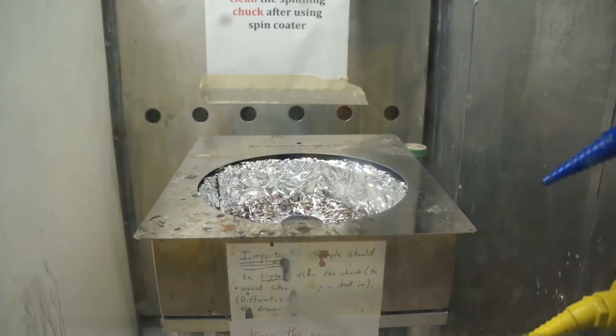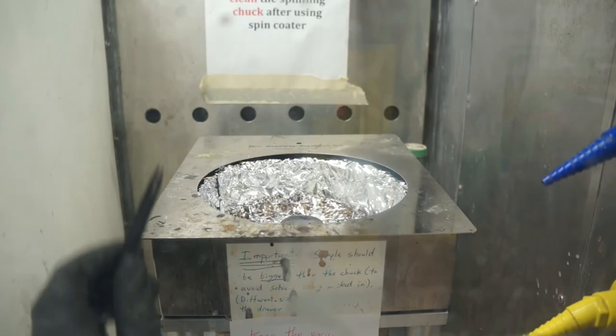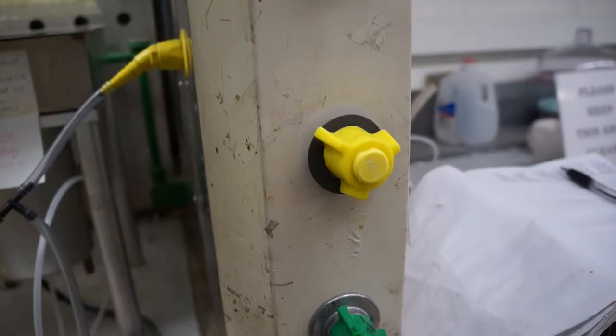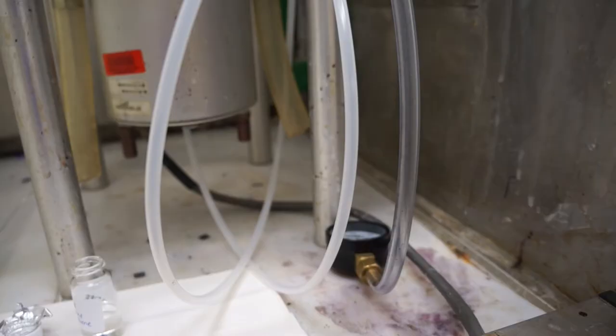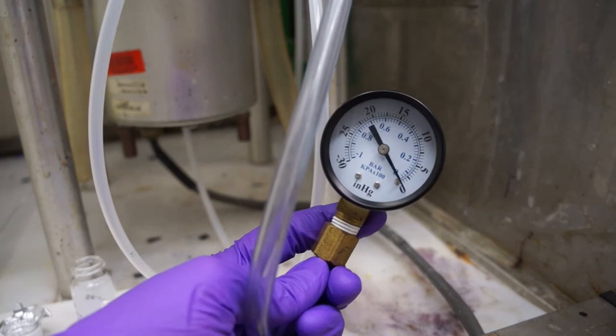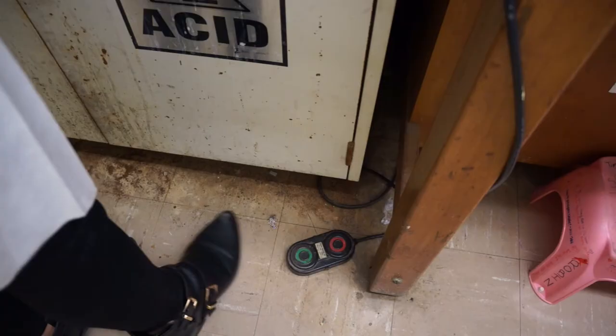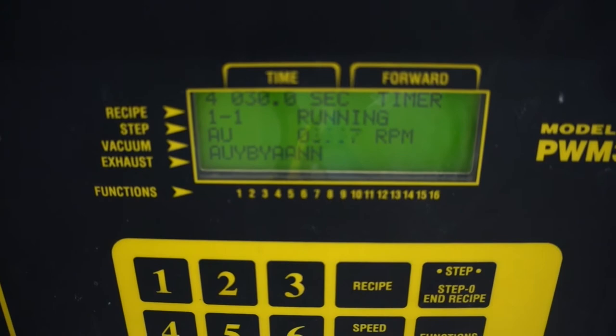Take a wafer floating in your HF solution and place it onto the chuck. When placing the wafer on the chuck, make sure it is centered on and entirely covers the small circle in the middle of the chuck. If it isn't totally covered, it may produce a bad vacuum seal and allow solution to get into the vacuum system. Open the yellow vacuum valve halfway with about three turns, the halfway point yields the best vacuum for this valve, and check the gauge next to the spin caster. It should read at least 22 inches of mercury. The yellow valve and gauge step might not be necessary. During the filming of this video, this was a temporary solution for a problem we were having with the spin caster. With the system in the ready state, we can press the green side of the foot pedal to run the set program. The first spin without applying solution is for spinning off any little droplets of water that might remain from the petri dish.